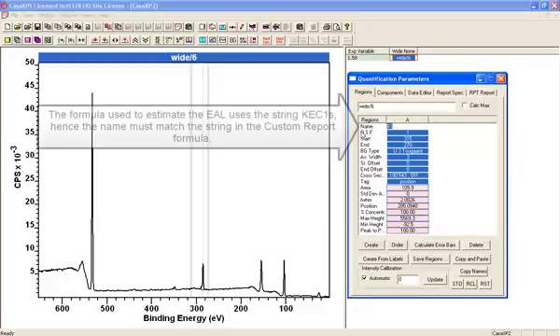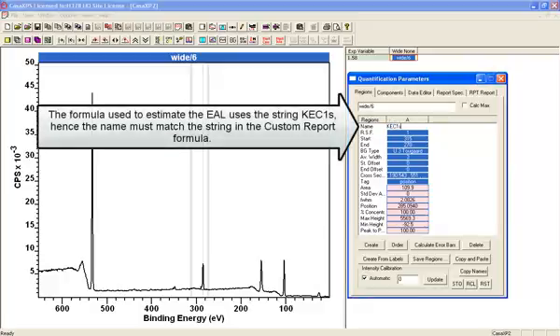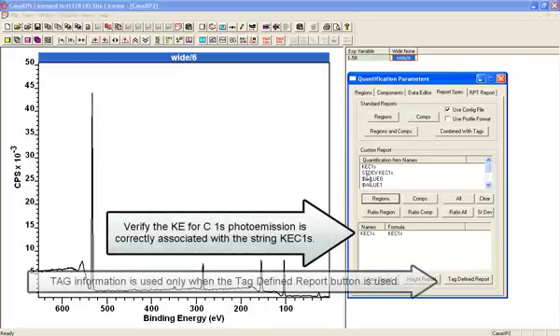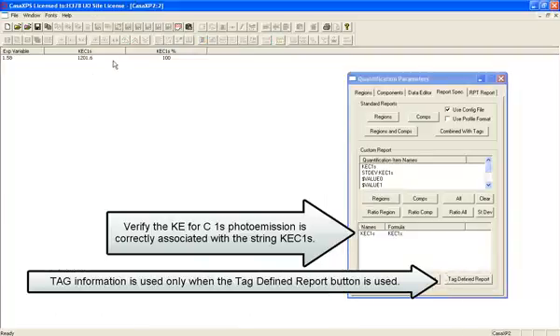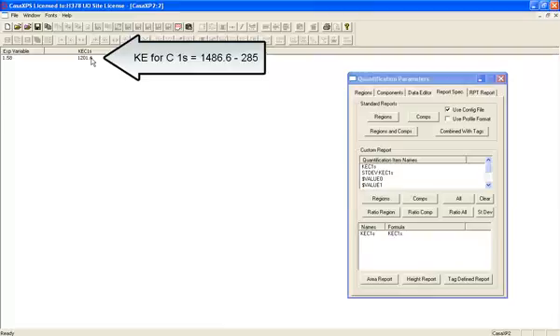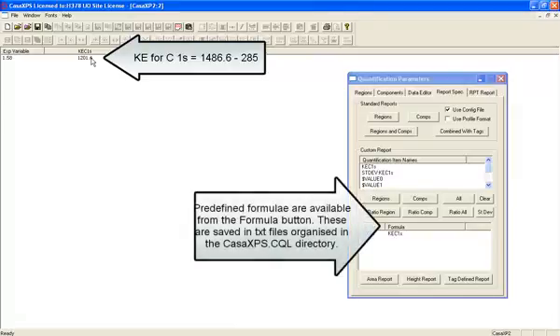So I'll call that KEC1S and I've specified a key string position so that when I use the tag report, and if I bring up just the name and use the tag defined report, then you can see that at this point I'm just reporting what the kinetic energy is for the peak that was defined by that region.